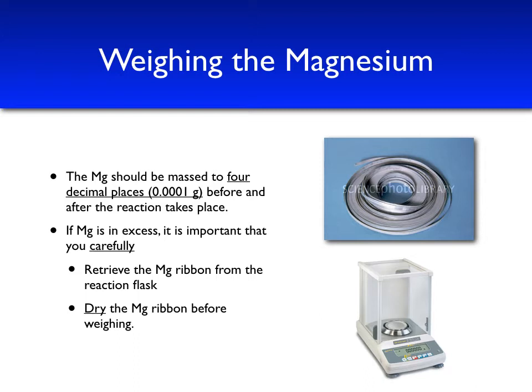It's also important to note that the magnesium is typically pretty fragile after the reaction takes place due to its surface being eaten away by the hydrochloric acid. So it's very important that we keep all pieces of the magnesium together to get our weighing.